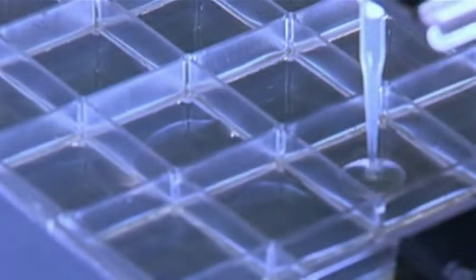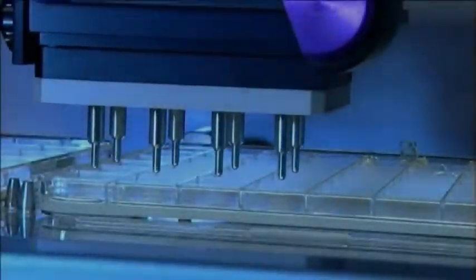Another manual process typically used in phage display and enzyme or strain evolution projects is plating and streaking of transformants. QPIX can plate and streak 96 samples in about 30 minutes. Compare that to even labeling 96 petri dishes manually.